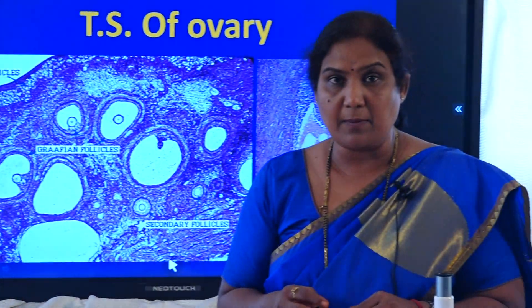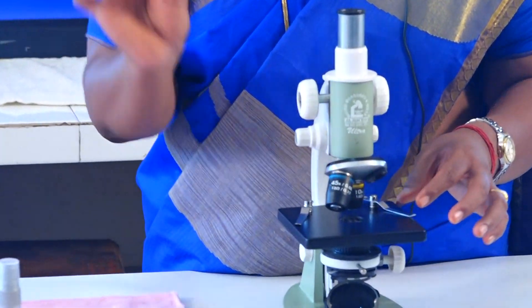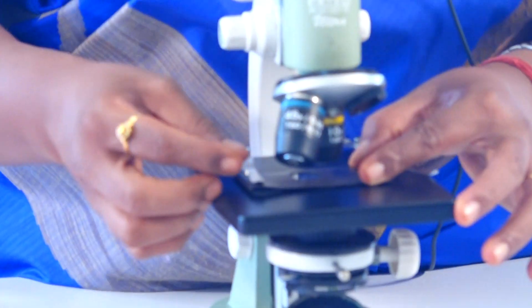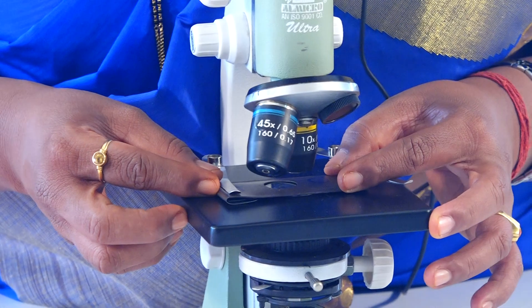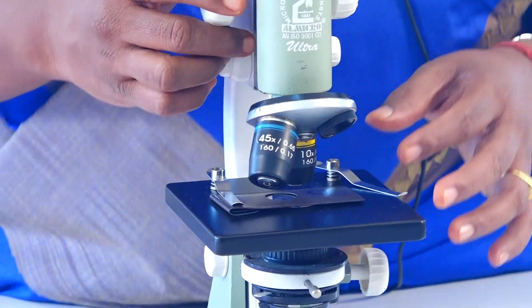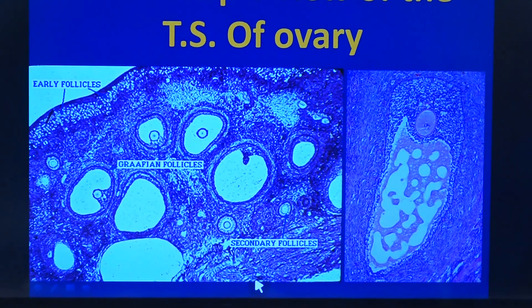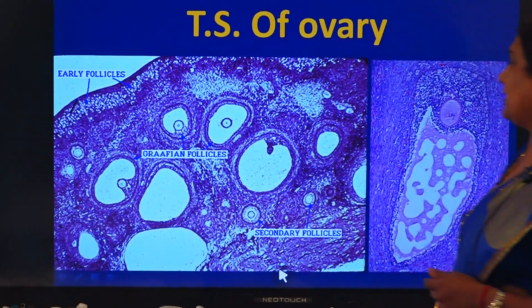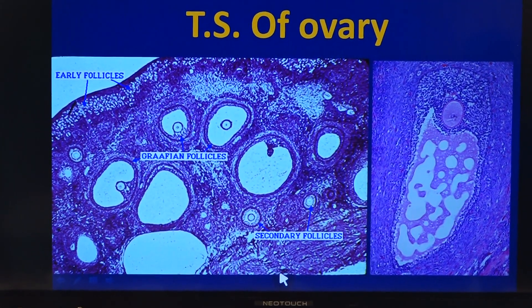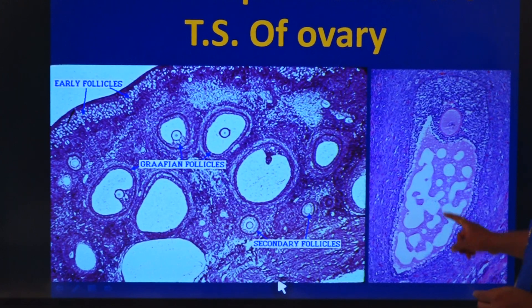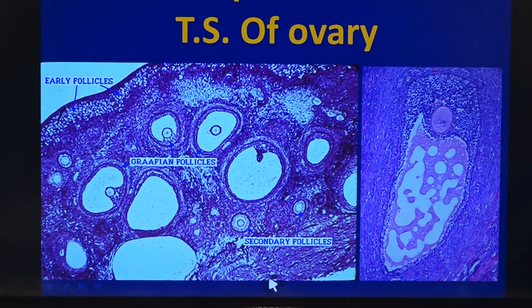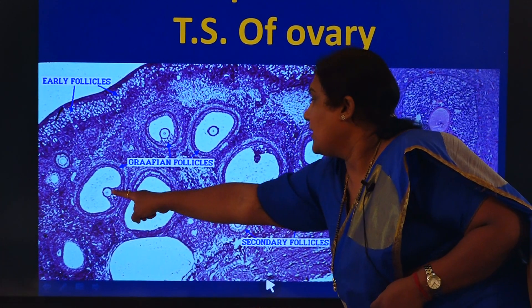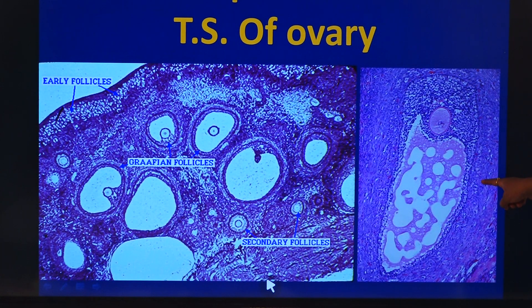The slide of the transverse section of the ovary is a permanent slide. Once again, we focus it under the microscope. In the microscopic view of the transverse section of the ovary, you will have to search for a Graafian follicle within it — immediately you will know it's a transverse section of the ovary depicting the Graafian follicle. What we are observing here is the secondary oocyte, this portion enlarged. Where we do not see the secondary oocyte, those are not the matured ovarian follicles.